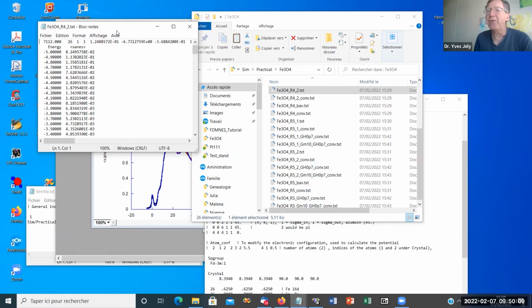Nevertheless, if calculations are well done, and if you study your material versus some parameter, for example different oxidation states, or the same absorption edge but for different compounds, in principle the shift to perform at the end between experiment and theory would have to be always the same. Okay?